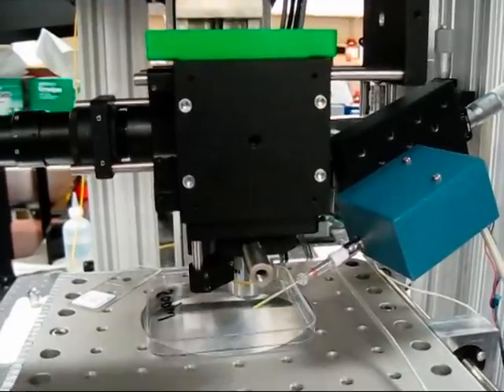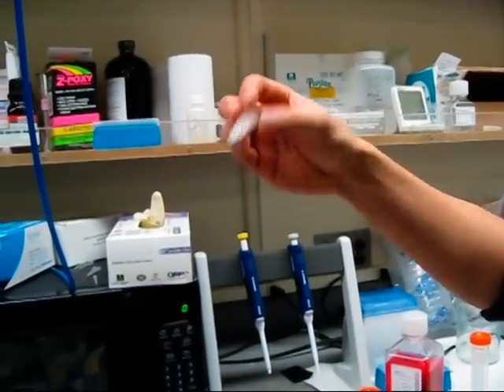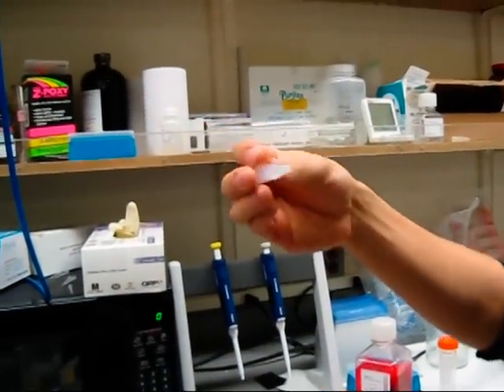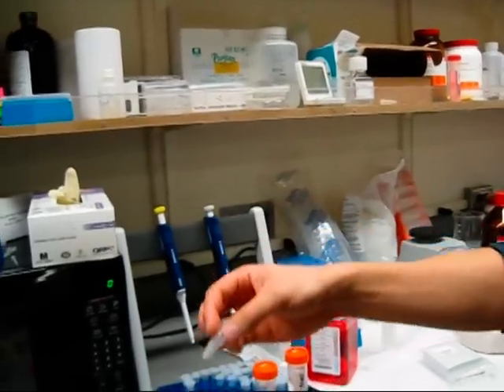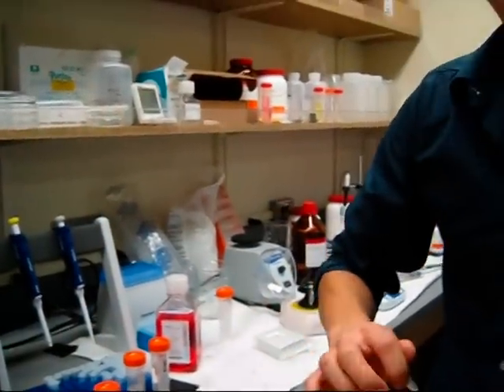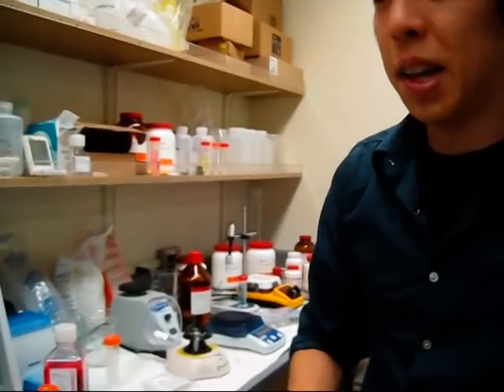In this case we're looking at zebrafish — a small fish. The embedding medium is a cross-linked polymer, like Jell-O basically. When it's melted we put the fish inside a droplet and then cool it down. The fish will be alive for several days, and we can image the brain activity in the fish.